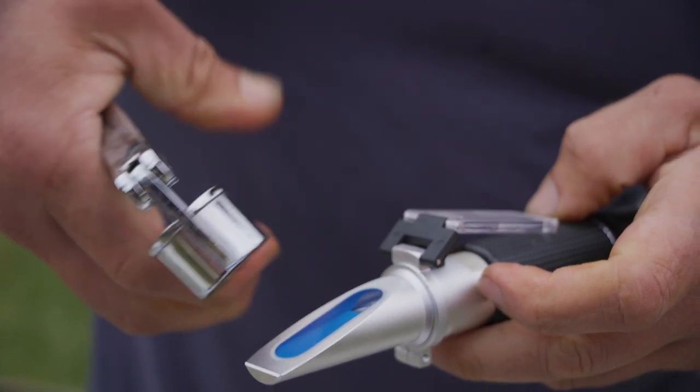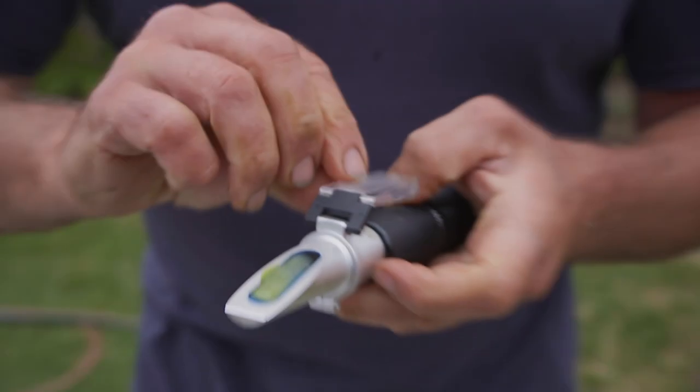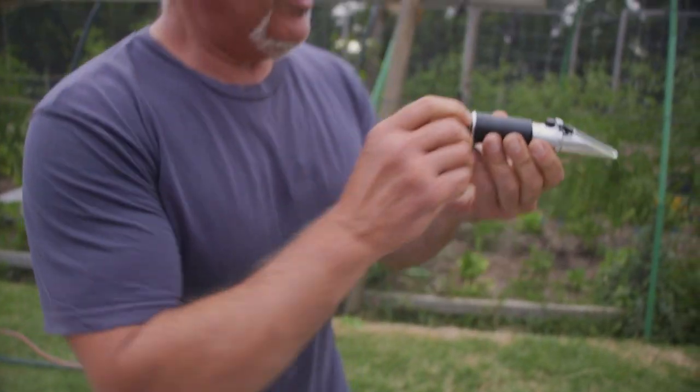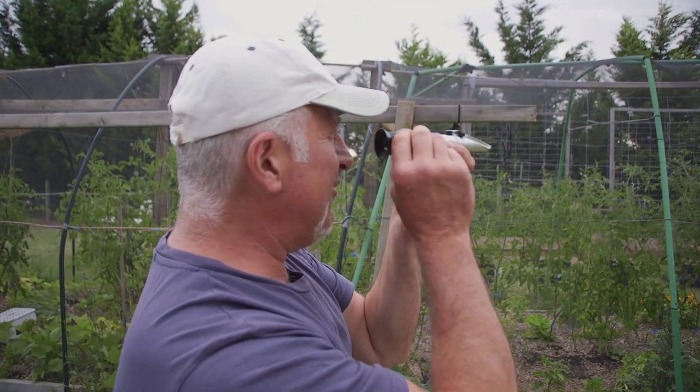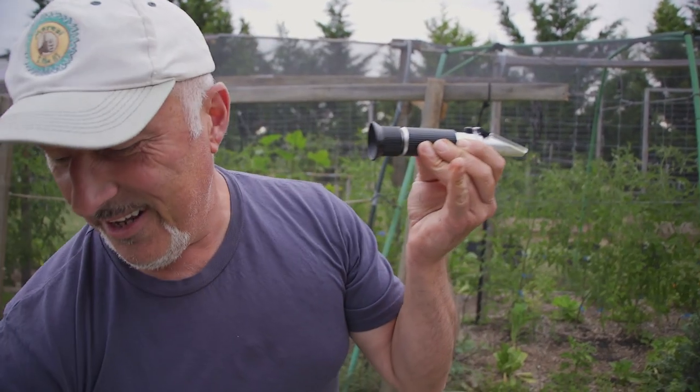Let's hope there's juice in this. Yes, there is. I'll put the cover plate on. Okay, here we go.